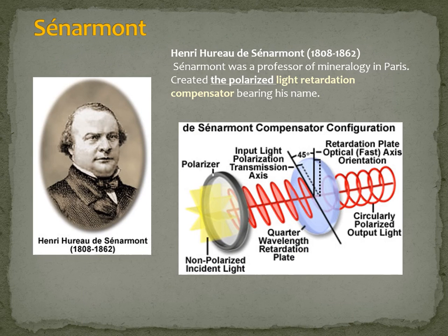One of the problems that light can create for the observer is that the waves are not all incident on the sample with the same angle of rotation, like you can see in here.